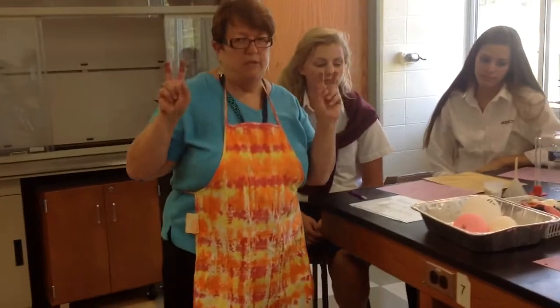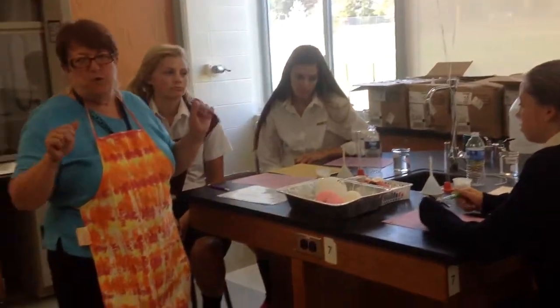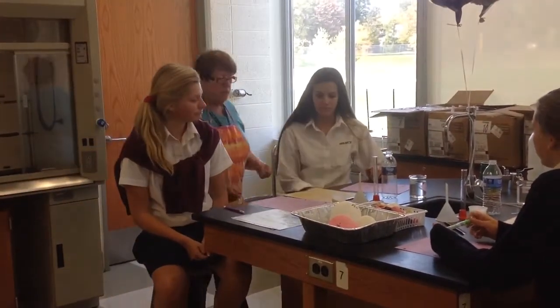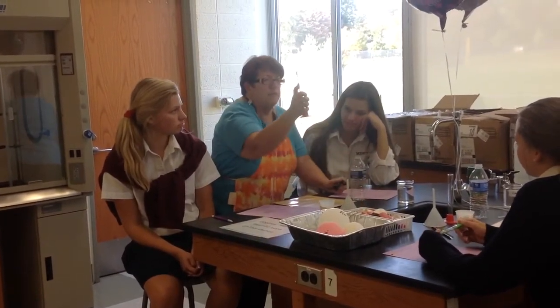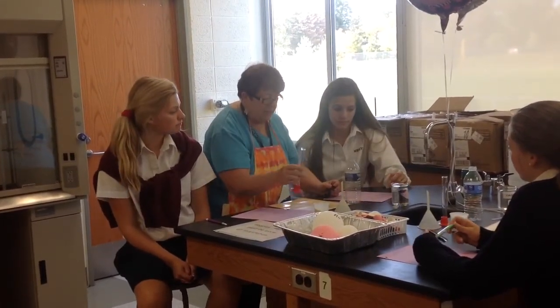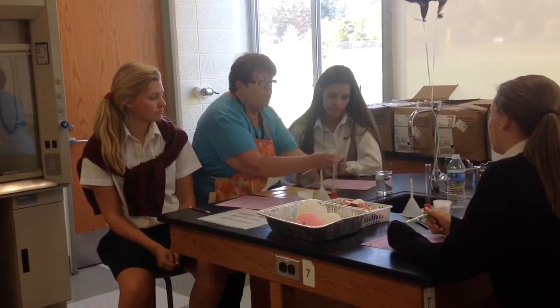The last station is the one you use chemicals with. And the chemicals are baking soda and vinegar. Ooh, tough stuff. But please do wear goggles for this part. Follow the directions as given here. A nice scoop of baking soda in the water bottle. Pre-stretch a balloon by inflating it and then letting the air out. Put 25 milliliters of vinegar in the cylinder, and again, about 25. Using a funnel, add the vinegar to the balloon.